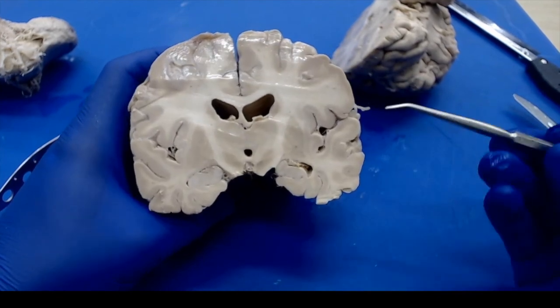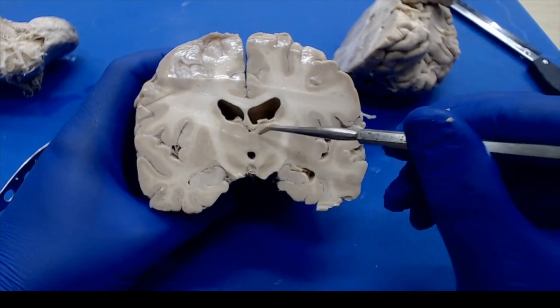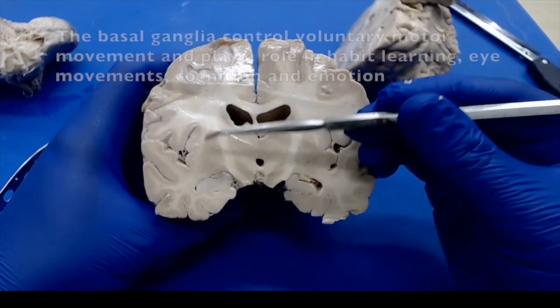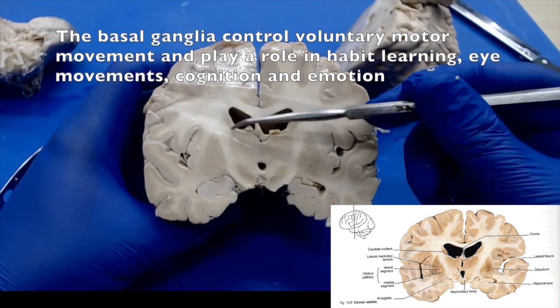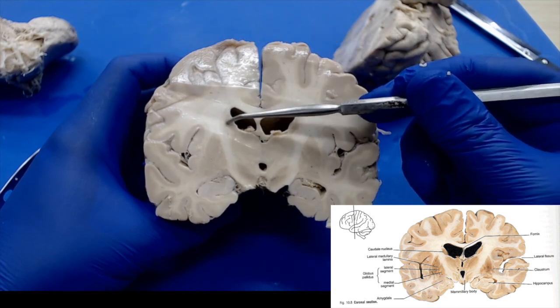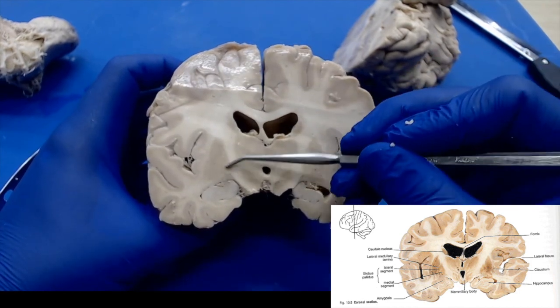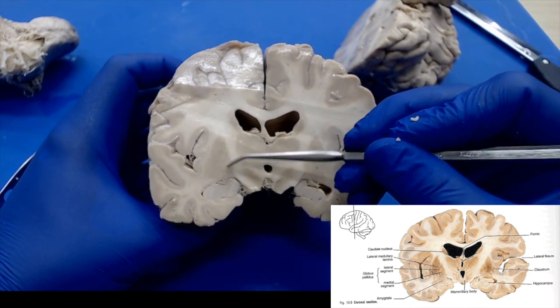So a couple of things we should note that we've already looked at the lateral ventricles here. We can see our thalamus in the center there. Some other structures you should be able to identify, and again you'll go into more details about the purpose, is this basal ganglia, which is these brown regions on the central component of the brain. So you have your caudate nucleus up here, this brown nucleus, just lateral to your lateral ventricles. You have your globus pallidus, these little brown regions kind of in the center here, making this little triangle, and the outer side is the putamen nucleus.